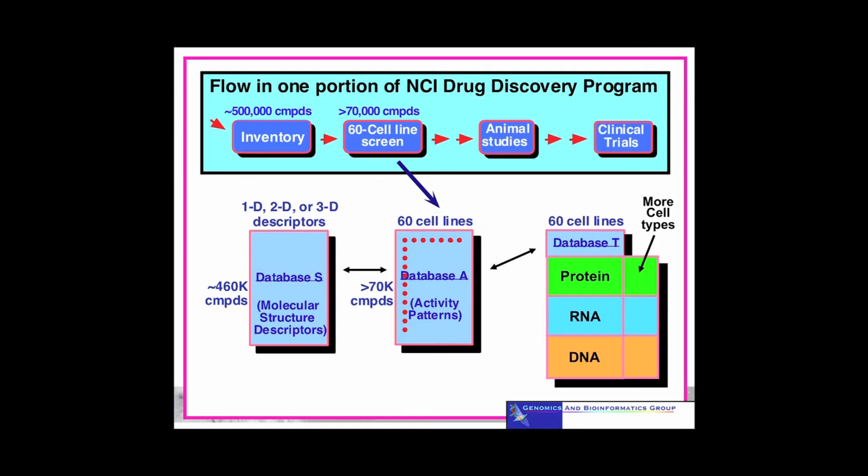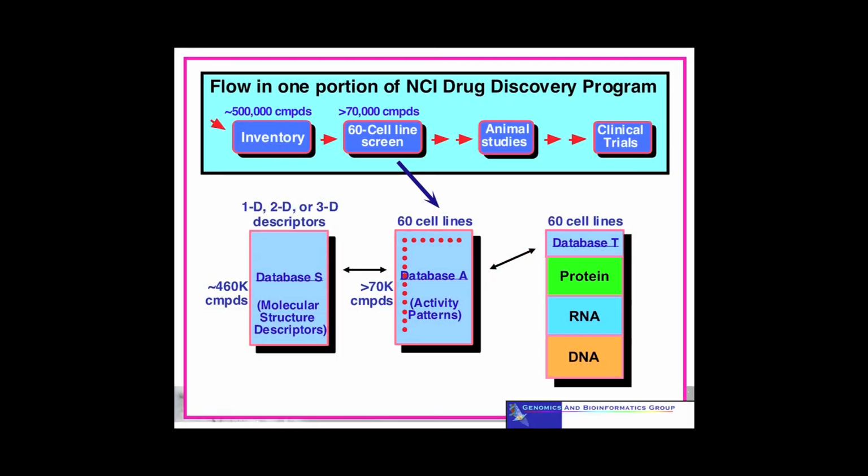So the NCI60 cell lines were profiled several times on Affymetrix expression arrays. So if you're working in TCGA and you've stumbled upon a signature in gene expression data and you say, hey, I'd really like to trace that into potentially an activity, a drug response profile, as a first step of translation, as long as it's the Affymetrix data, then you can do that really easily.